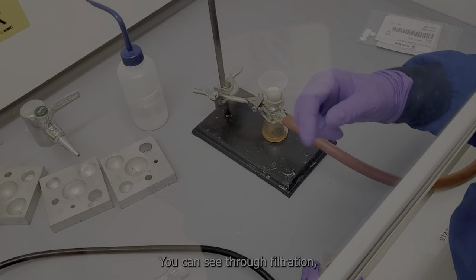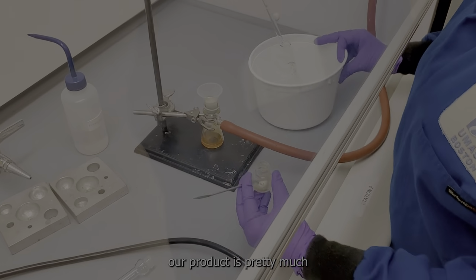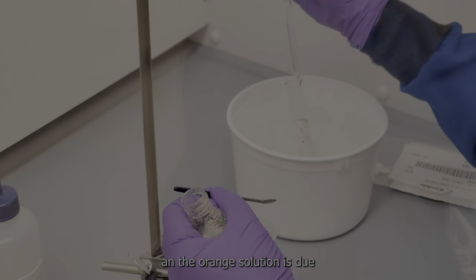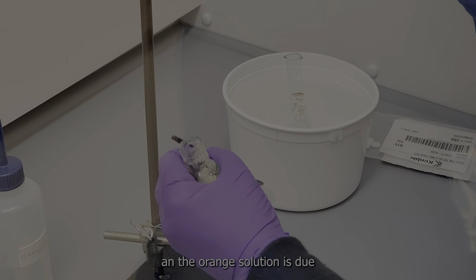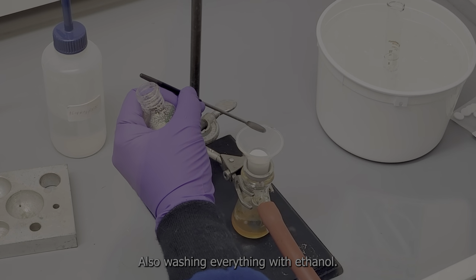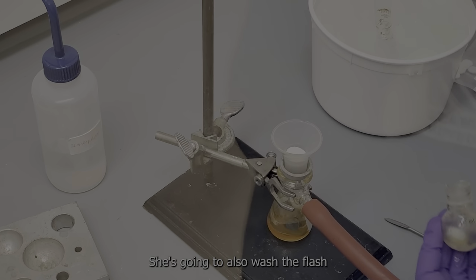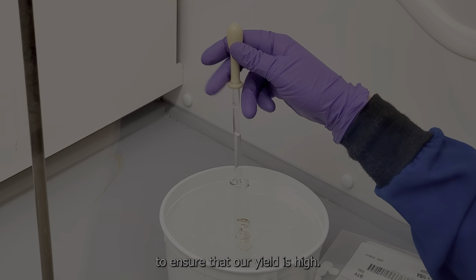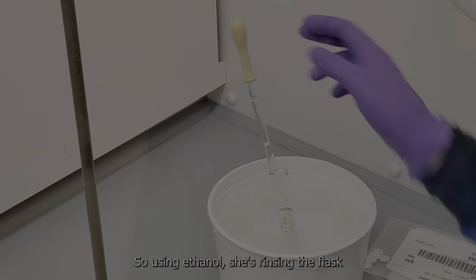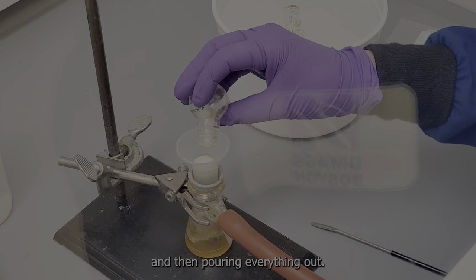You can see through filtration, our product is pretty much a pale white color, and the orange solution is due to the pyridinium. Notice Tara is also washing everything with ethanol. She's going to also wash the flask to ensure that our yield is high. So using ethanol, she's rinsing the flask and then pouring everything out.